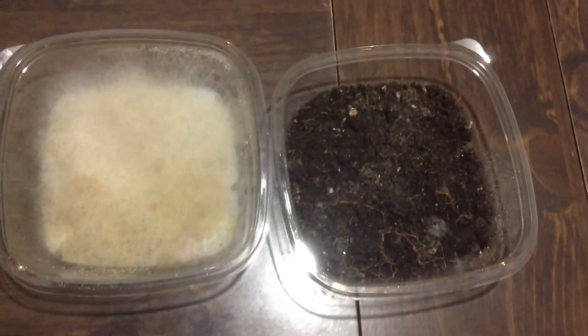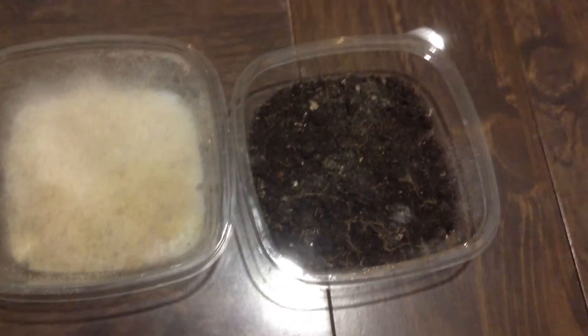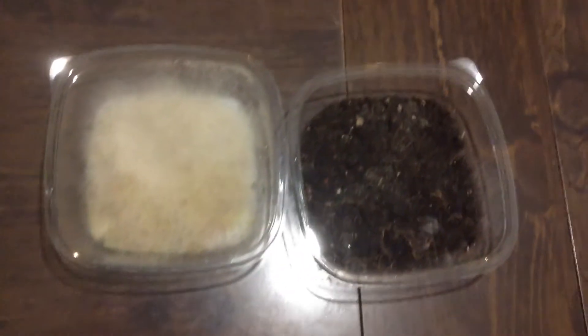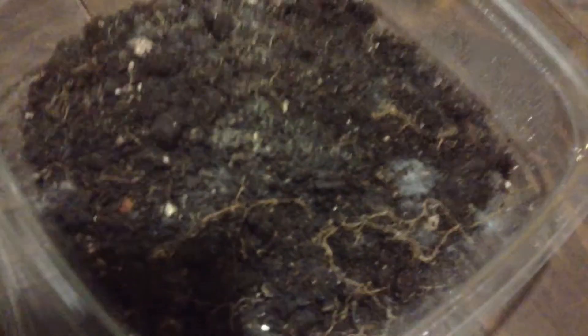Having living soil is an amazing thing because your plants will grow way better than anything that Miracle-Gro or any other chemical can do. This is Earthman from Origami's Living Soil, showing you the second part of this video. One more close-up of this one — yikes, that's some furry stuff there; I think this needs a shave. There's not as much carbs in here because there's no living plant to provide the carbs, but there are some colonies forming here and there. That's living soil for you, my friends.